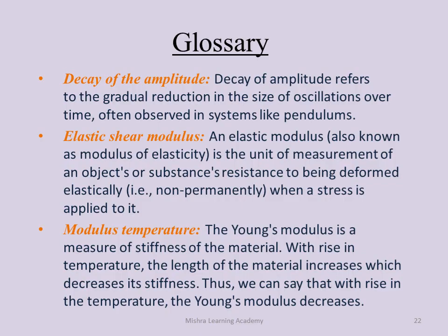And what is modulus temperature? The Young's modulus is a measure of the stiffness of the material. With the rise in temperature, the length of the material increases with a decreased stiffness. Thus, we can say that with a rise in temperature, the Young's modulus decreases.